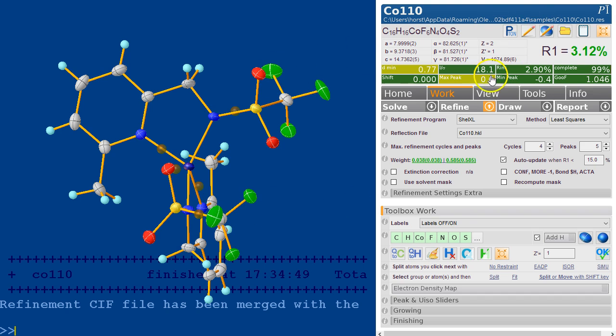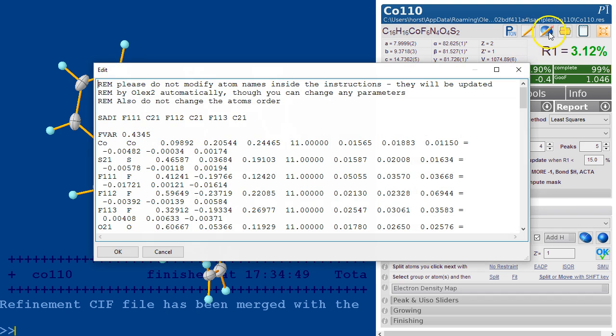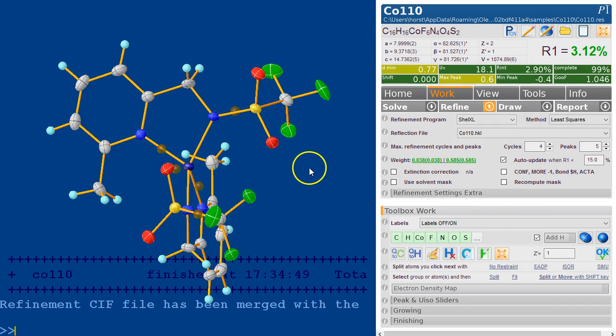So between these tools, the graphical interface and the ability to edit something in a file here, you can do everything you want. On the other hand, we really discourage people to edit these files. You can if you want to, but there is really no need to do this.